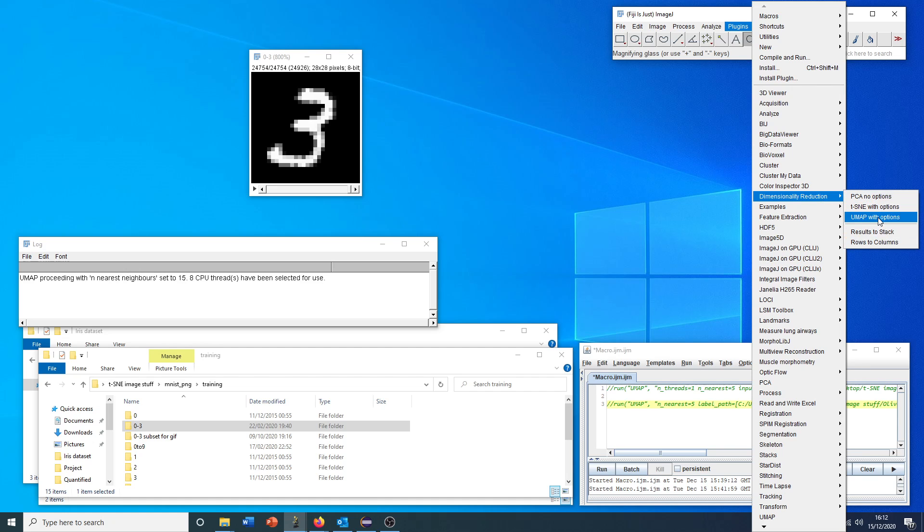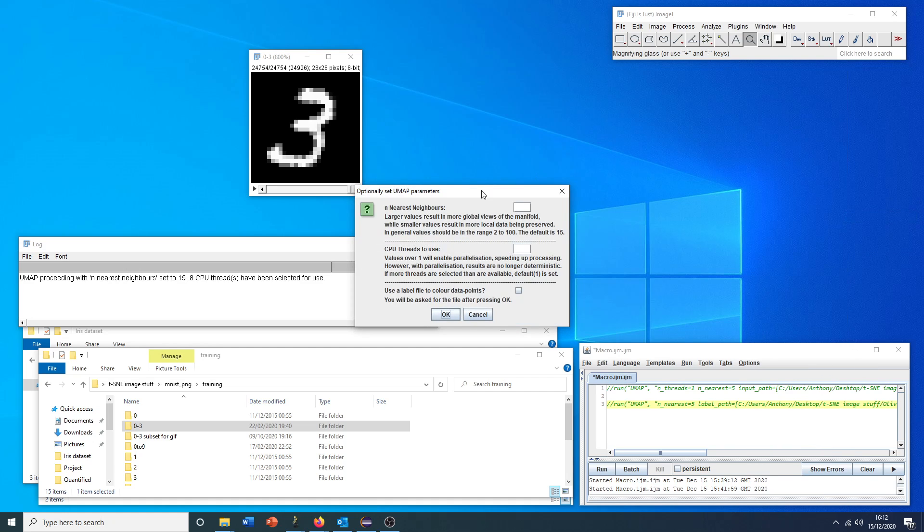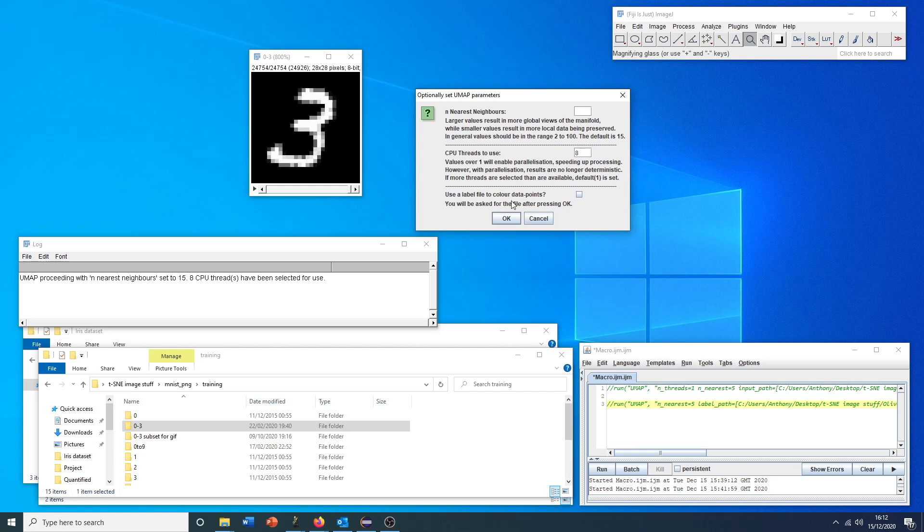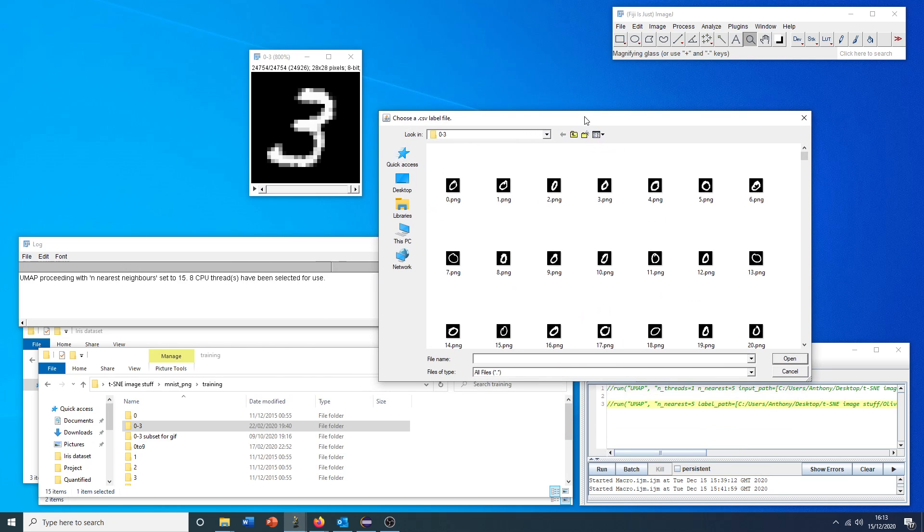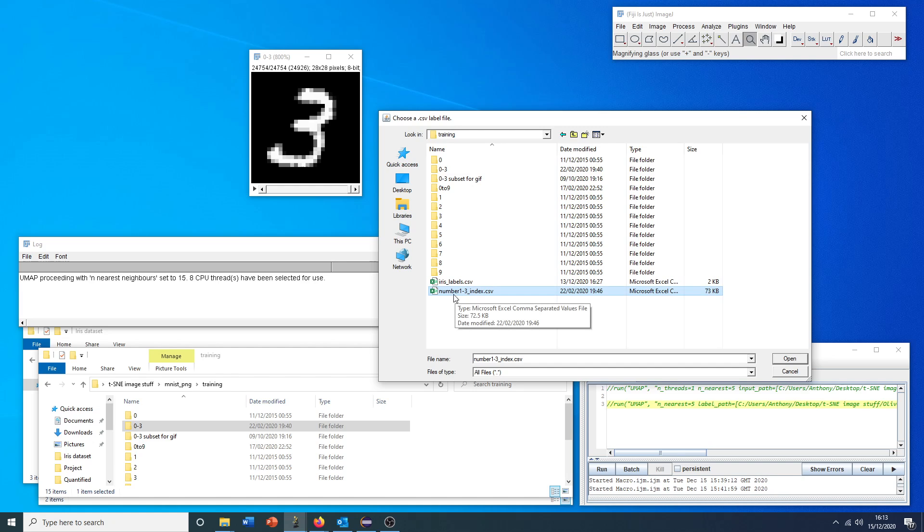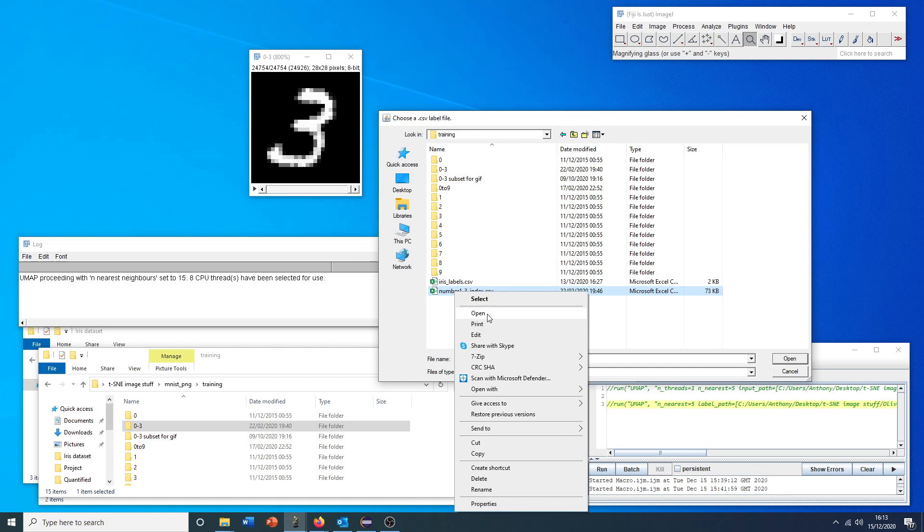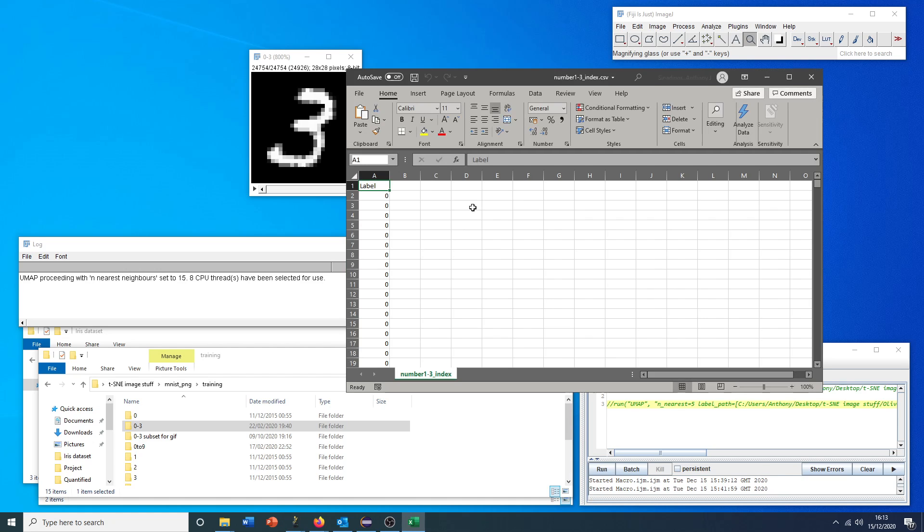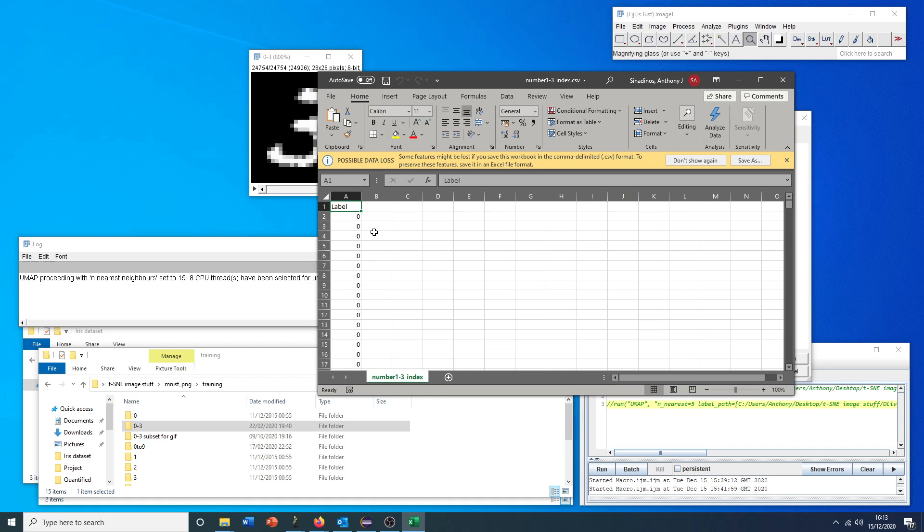What I can show you next is this other feature. We'll run UMAP with options. I'll just use that as we did before. But remember that because it's not one thread, the result may not be exactly the same as we saw before. This time, we'll choose to label our data points or color them according to some state that we define. If we click OK, the first thing that the plugin will ask for is this label CSV file.